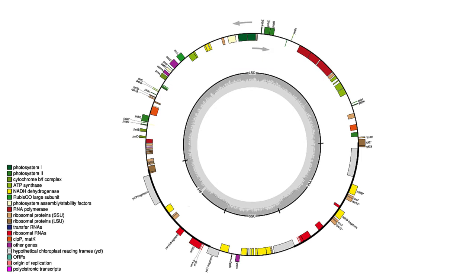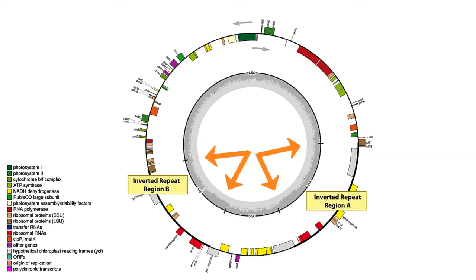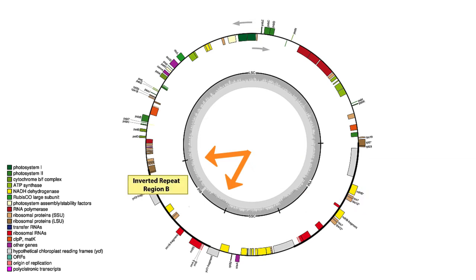There are two repeat regions, one is a mirror image of the other. They are the inverted repeat regions, IRA and IRB.